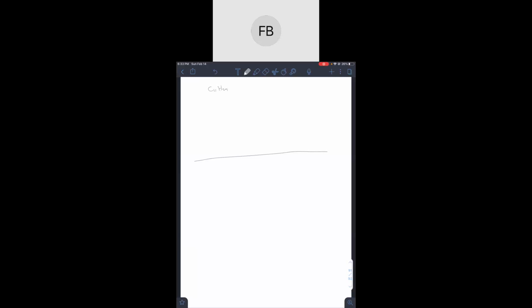Okay, so here he has some peak, and this is a 5 multiplet. Okay, 5 multiplet. So that tells us that there's 5 hydrogens. And this is all the way, again, at 7. So we know that this is our aromatic ring. So that's a pattern you guys have seen before.